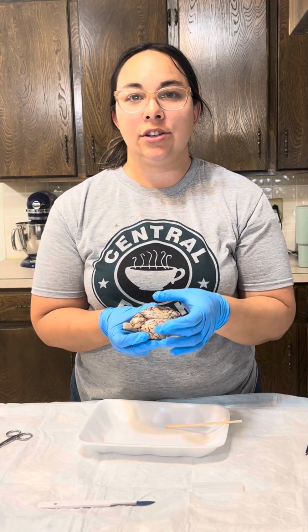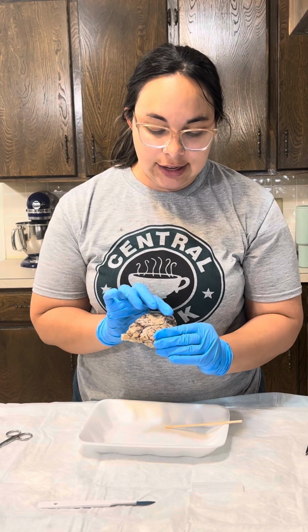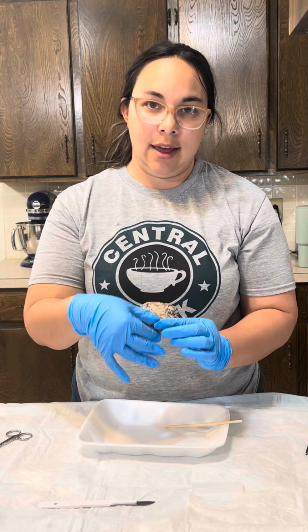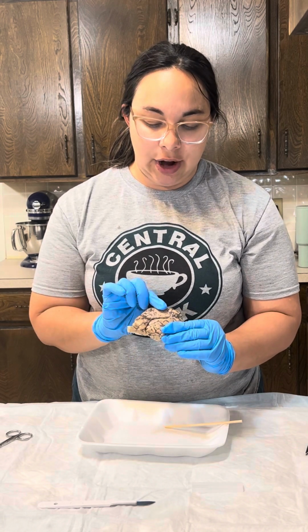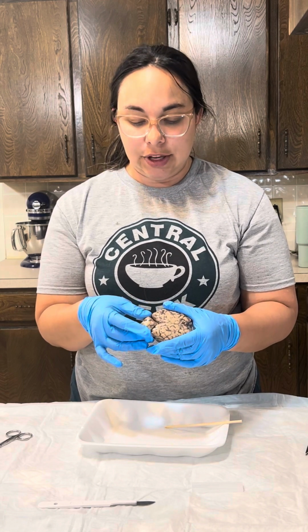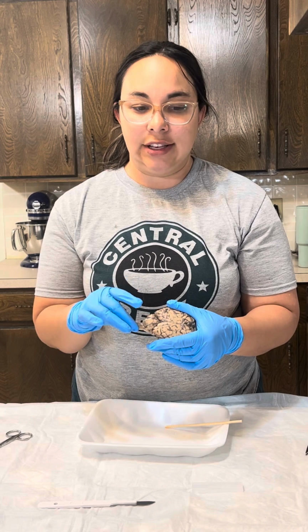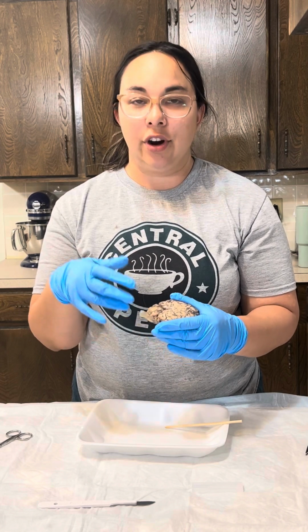This is the cerebrum, and this is responsible for your higher mental function. The cerebrum is separated into hemispheres, a left and a right hemisphere. So that's this part right here. And then this is the cerebellum, and this is responsible for your balance and coordination. And then we have the brainstem, which is responsible for your involuntary movements and reflexes and things like that. So those are the three main parts here.